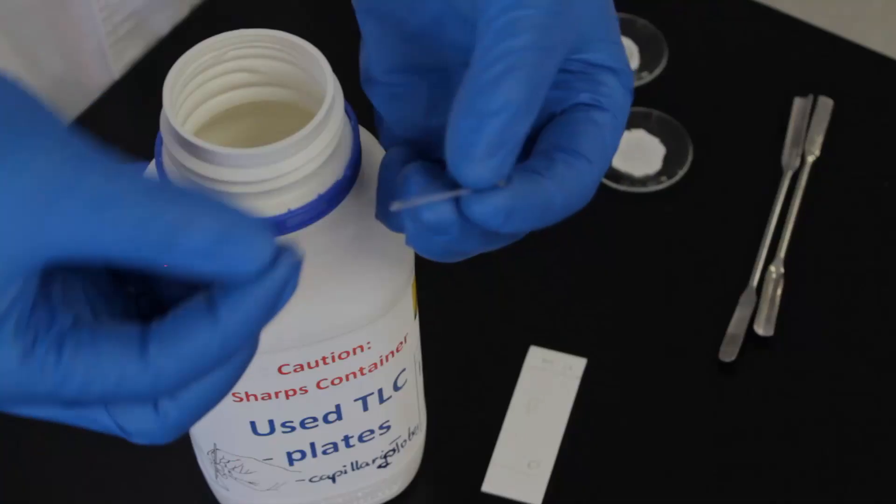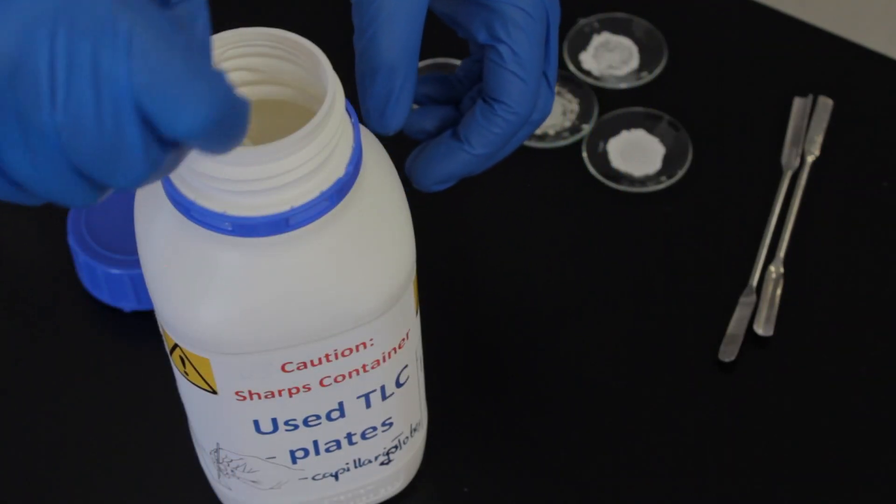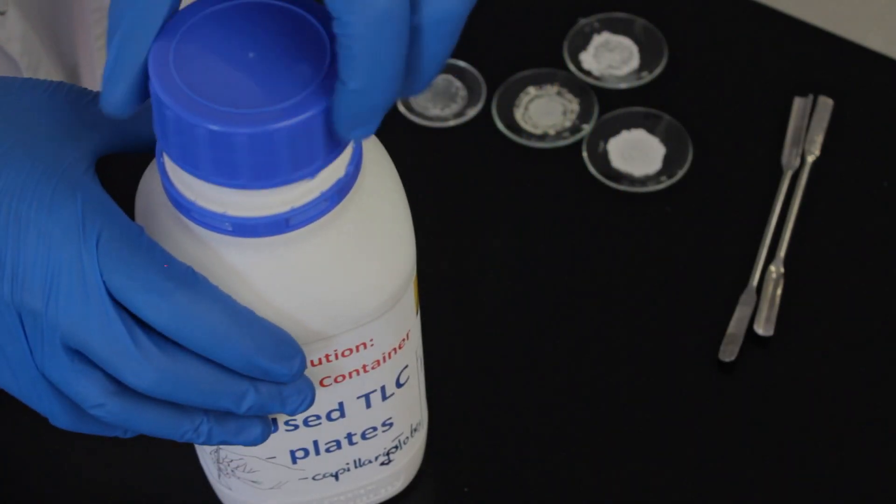You'll also need to measure the melting points of your two samples. Once you're done, make sure you dispose of your TLC plates in the containers provided and wash your watch glasses.